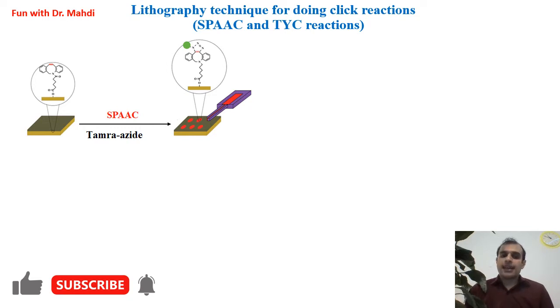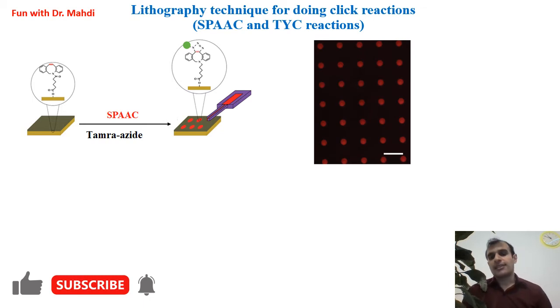And now you need to take a photo with a fluorescent microscope and we will have something like this. You can see the red dots on the surface. These red dots are TAMRA azide. When we have TAMRA azide on the surface, it means the click reaction between azide and alkyne has taken place, and the click reaction was successful.